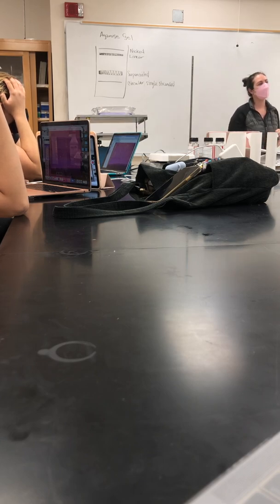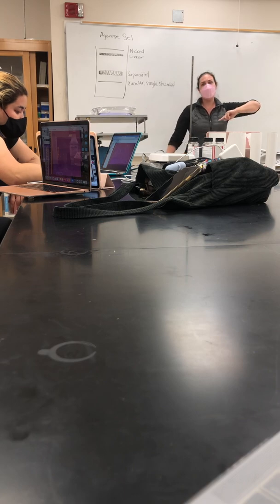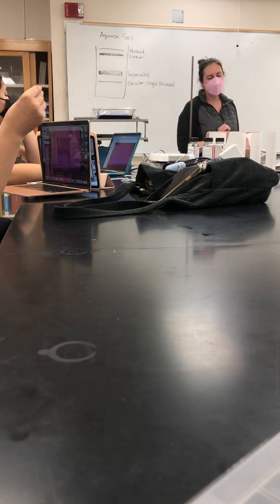Now, is your nicked DNA going to be faster or slower on your gel? Slower, okay? So what does it tell us about its molecular weight? Should it be higher or lower than our circular single-stranded DNA? Great job. So we want to make sure we understand how our gels are working. Then we have our linear DNA, and then what we're after is the supercoiled DNA. So it's really important to make sure we see where our supercoiled DNA is. Again, on the agarose gel, it's really hard to see. But on the acrylamide, it's going to be that lower band that we do see.